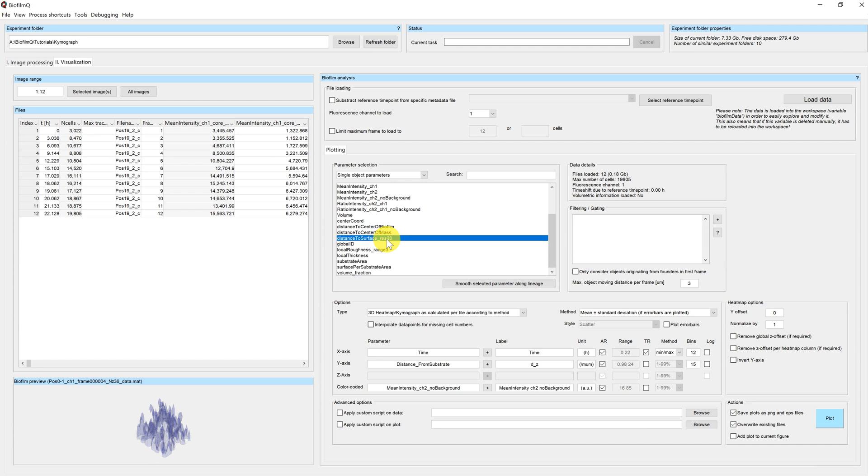Other possibilities of spatial parameters would for example be the distance to the center of the biofilm. We choose the distance to the surface as a new axis.